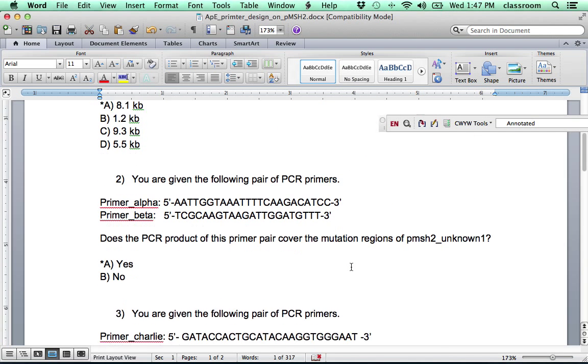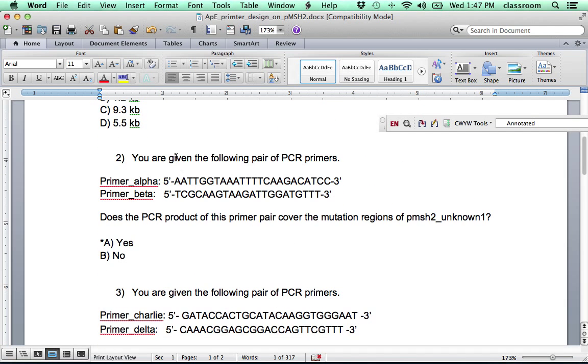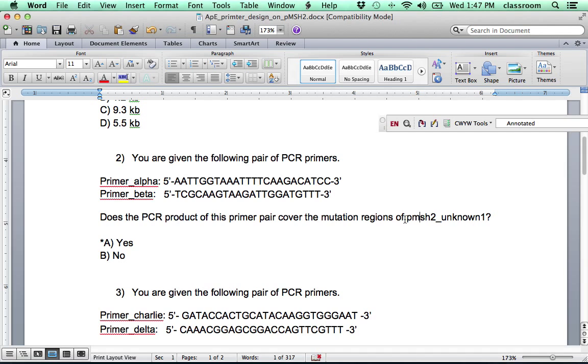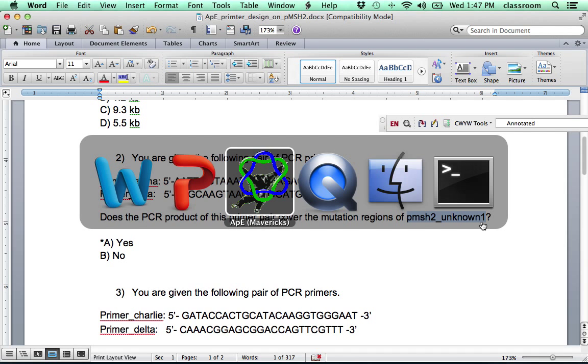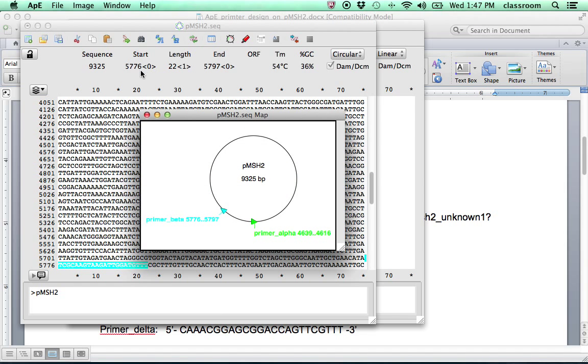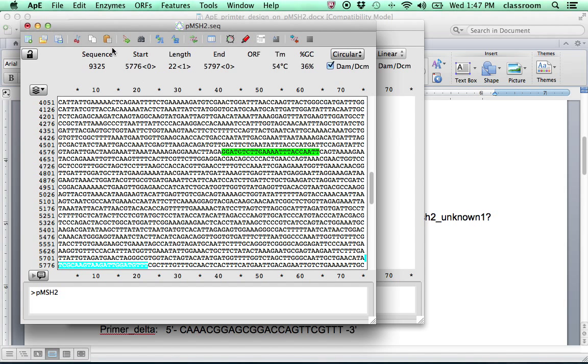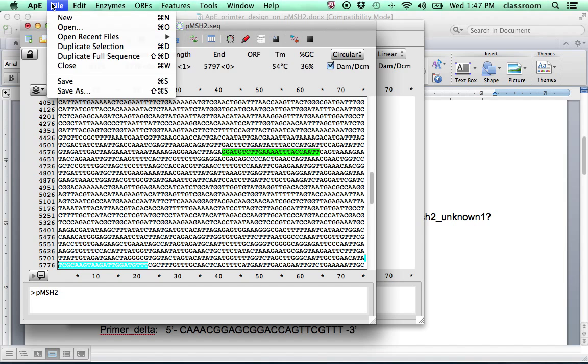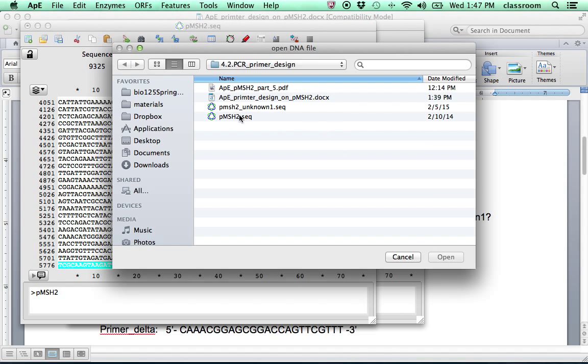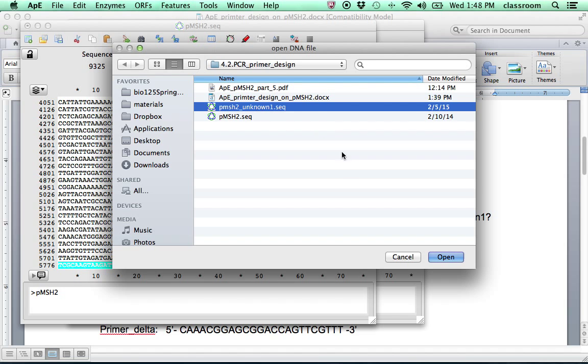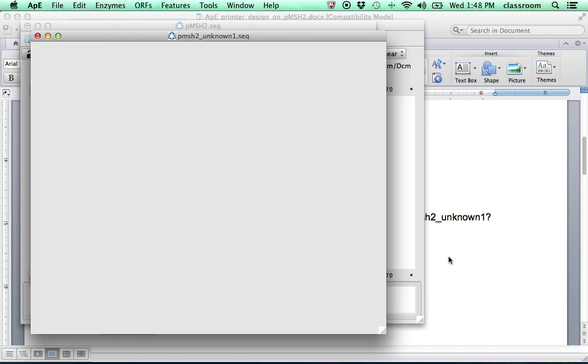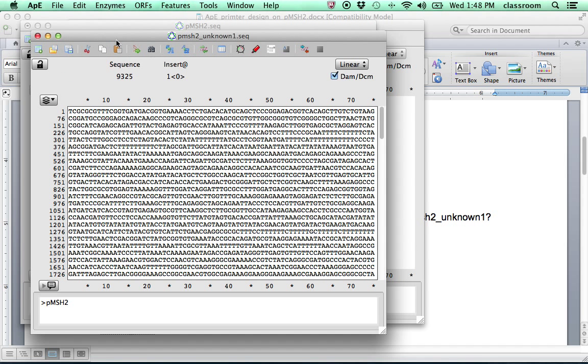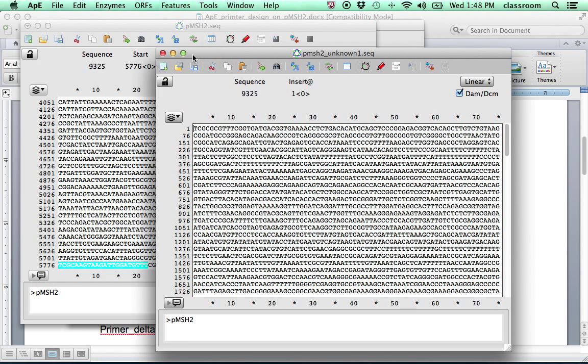Let me look at the second question. So there, primer alpha and beta. Does this PCR product cover the mutation region in plasmid pMSH2N1? So that sequence is also given to you. So let's go back to APE. This time, go to File, Open again. Add the pMSH2N1.